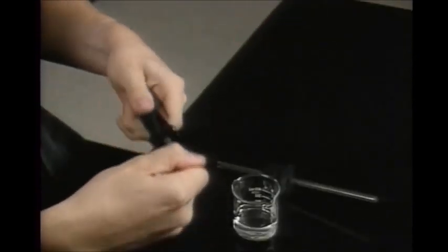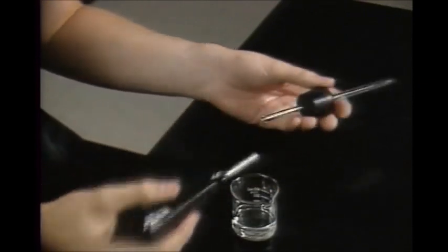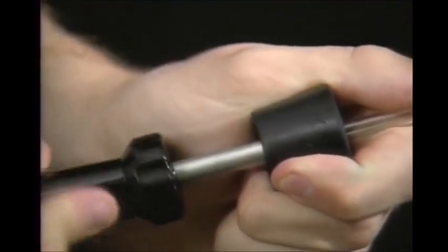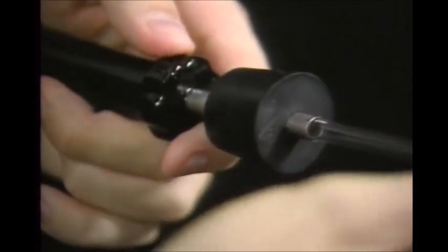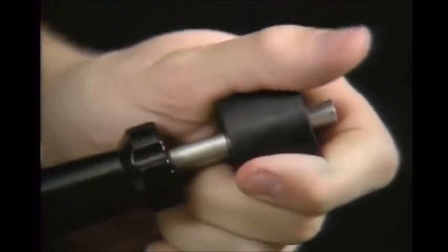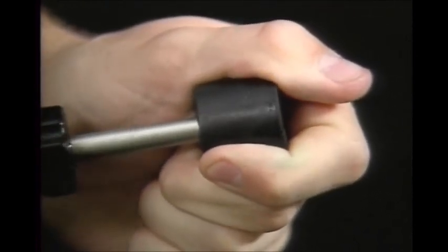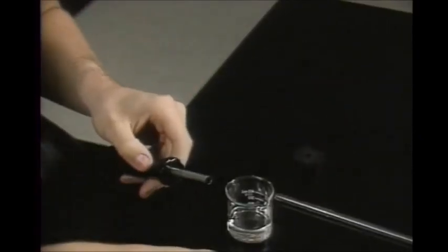To remove the tubing, take out the tip and lubricate the end of the hollow shaft. Push it through the stopper hole around the tubing. Then slide the tubing out through the shaft and remove the inserter. Remember to wash the lubricant off before returning the stopper and tubing to storage, and don't forget to replace the tip.